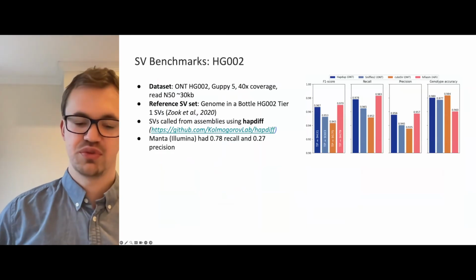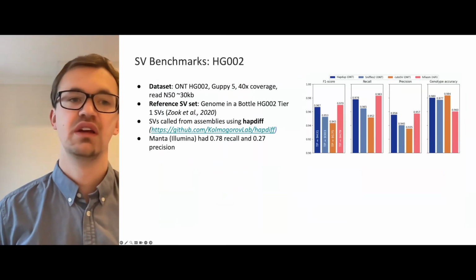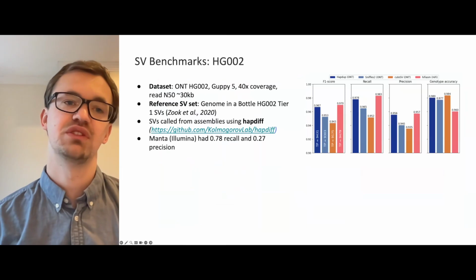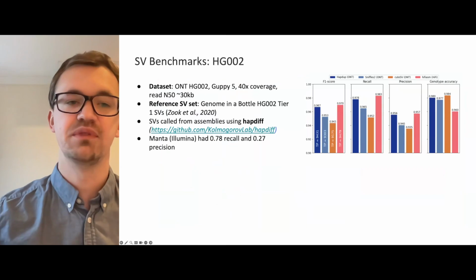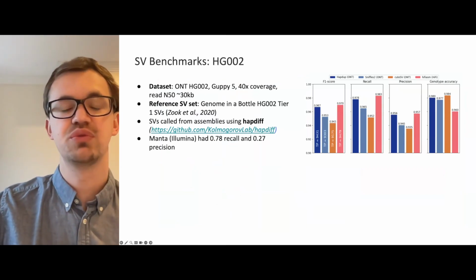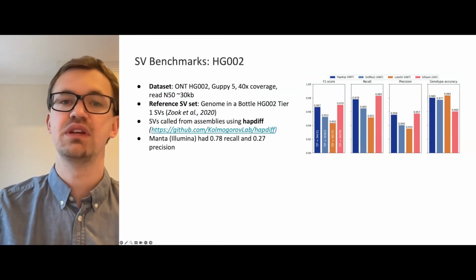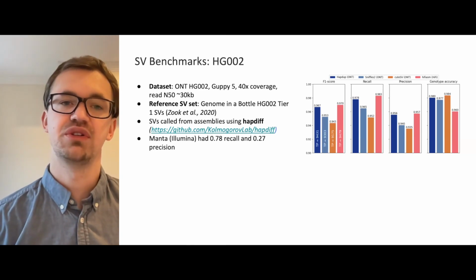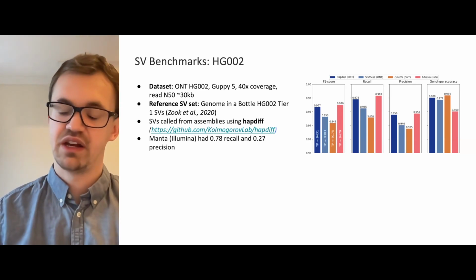So we of course wanted to measure how good these assemblies are, and this is the structural variant benchmark. Structural variant calls that were produced using these assemblies, and we benchmark it against the Genome in a Bottle call set. As you can see from the benchmarks on the right, our Hapdup scores were slightly improved over the mapping-based approach, and slightly below the HPRC-based assemblies produced by a mix of different technologies. But as you can see, the consistency is overall pretty high, and we're pretty happy.